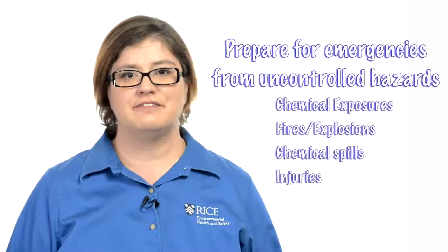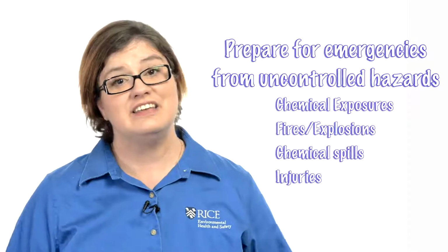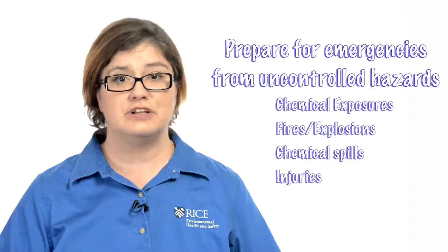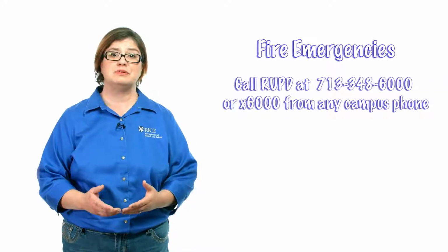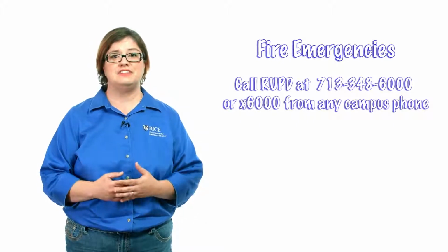The last part of the RAMP method is preparing for emergencies from uncontrolled hazards. These can include fires and explosions, injuries, chemical exposures, as well as fire and medical emergencies. In any medical or fire emergency, you want to call the Rice University Police Department, and you can find them at 713-348-6000 or by dialing 6000 from any on-campus phone. They will dispatch the fire department or ambulance as necessary.